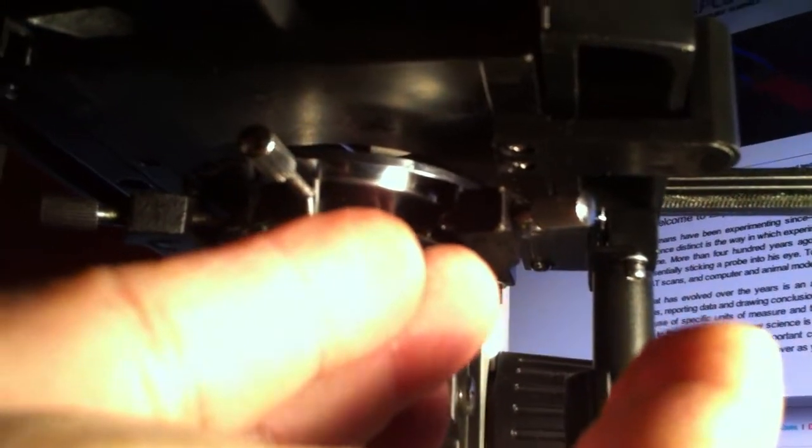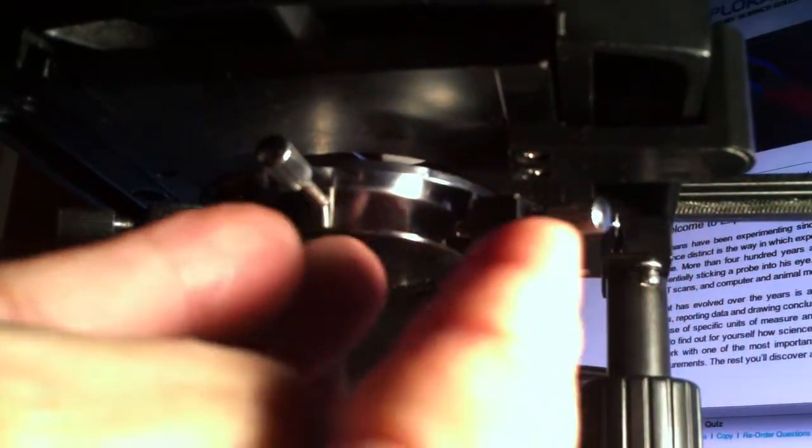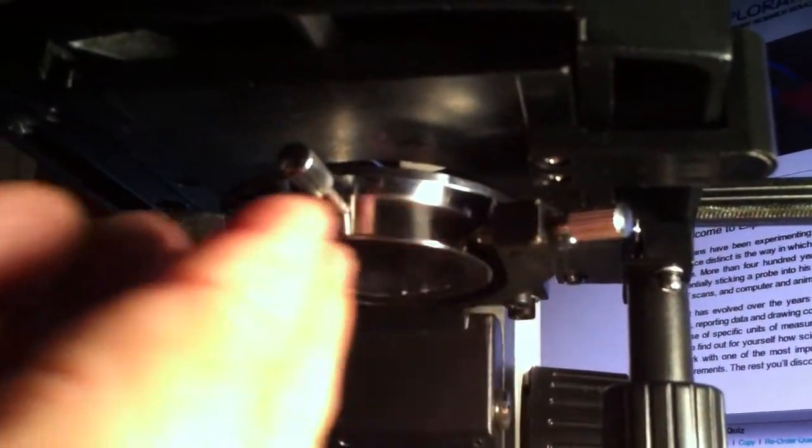And those two screws, if you back one off while tightening the other one, it moves the whole assembly to one side. If you do the opposite, it moves it to the other.